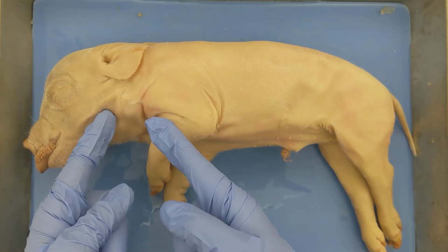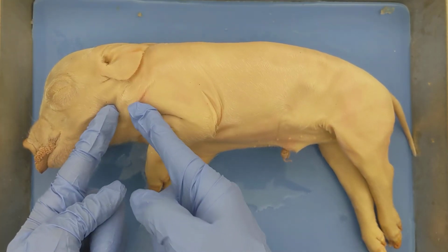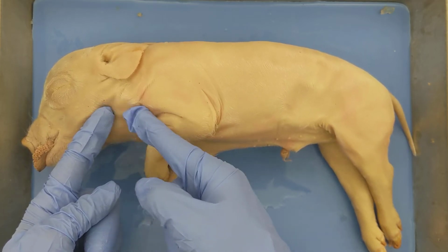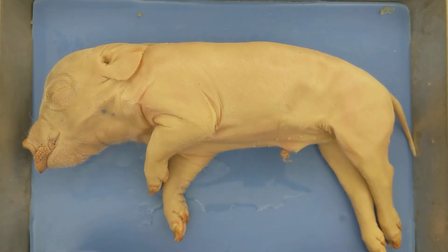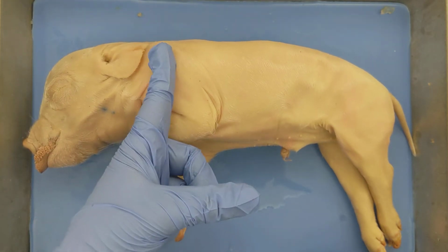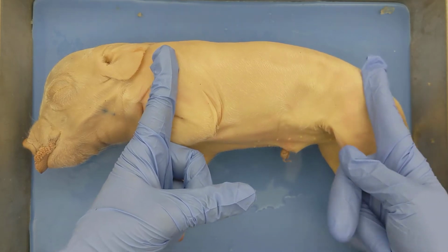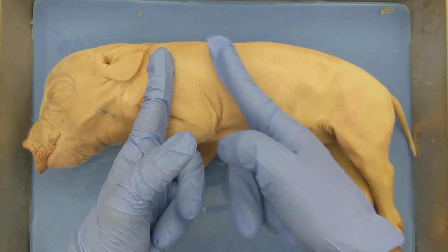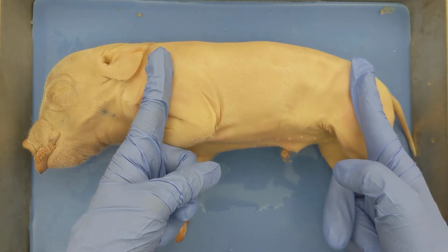There's a neck. So the neck region is here from the base of the head until right about the shoulder blades there. So that's the neck region. The trunk refers to the region on the pig that is between the pig's shoulder blades, which are here, to the pig's hips. So this region here, from shoulder blades to hips, that is called the trunk.